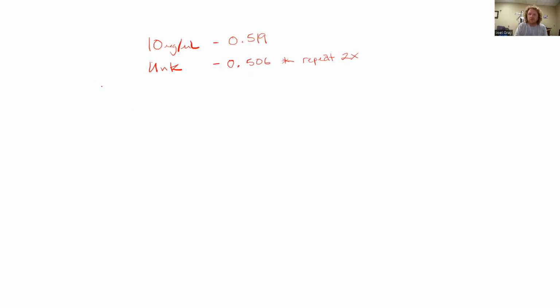So let's say hypothetically, your subsequent data points are 0.495, 0.485. Well, then you could add those 3 up and come up with the average. And that average is probably going to be about 0.496, we'll say.